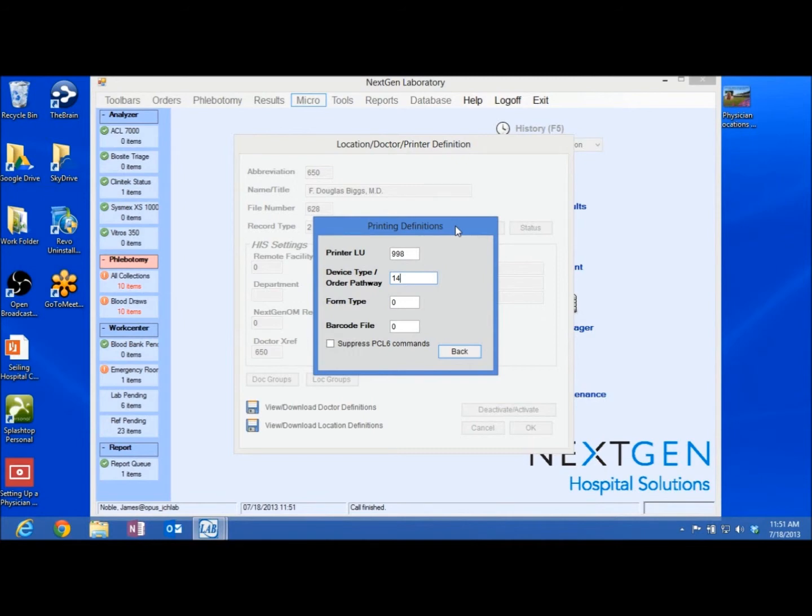Call it adding a physician location. Open that document up, and you can quickly remember these numbers. Or I can make this even a little bit easier for you. Just log on to YouTube and open up this video, and there you'll find the information right there.